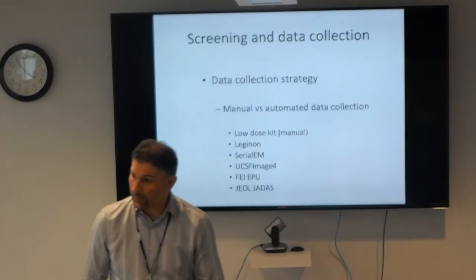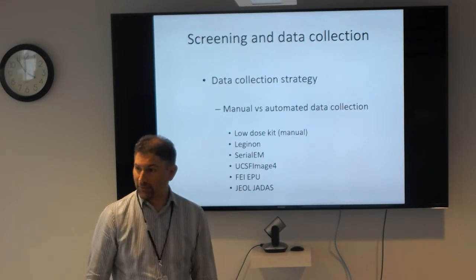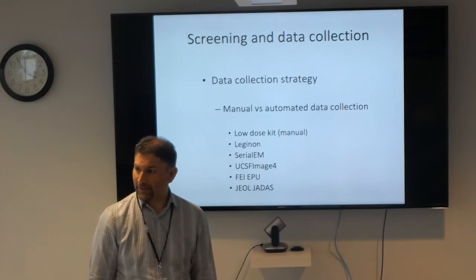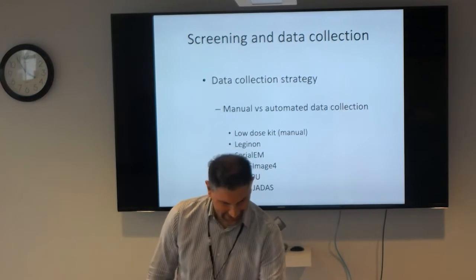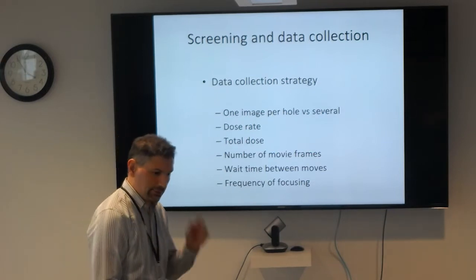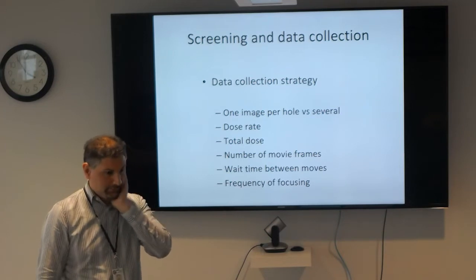There's also Gatan Latitude. I was not aware of that. There's Gatan Latitude. Thank you for that. Is that a new one? They've been beta testing it for a while, but okay. It's not. Okay. Well, no opinions. There's Gatan Latitude out there as well. And I assume this comes with the K2s. I'm not sure. Okay. Yeah, well, the K3s. Okay. Last I heard, yeah. Okay.